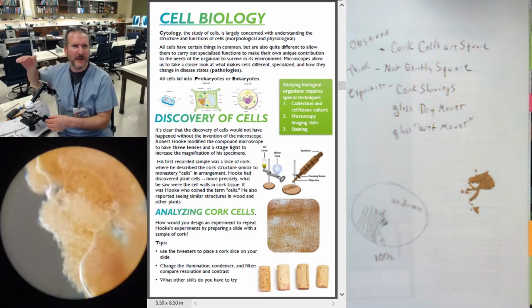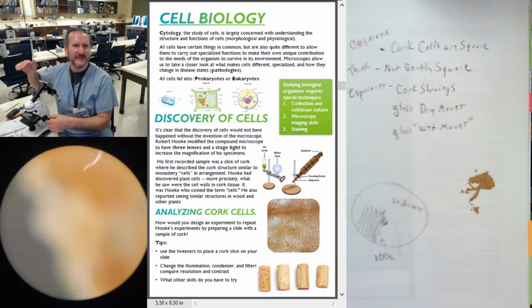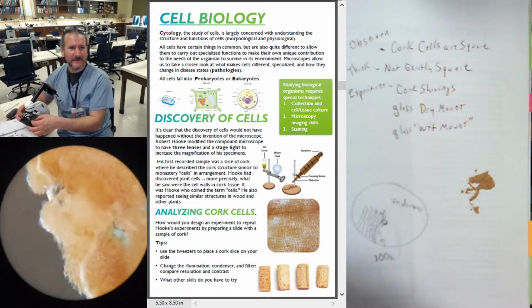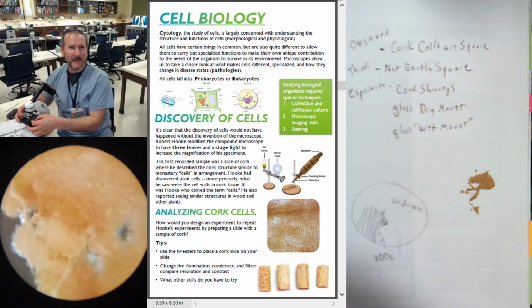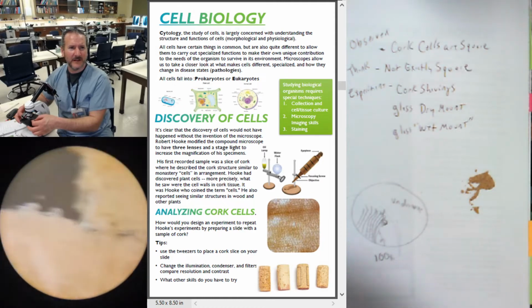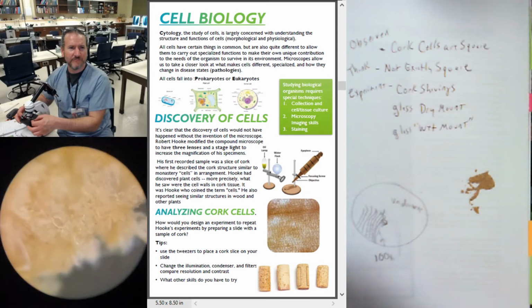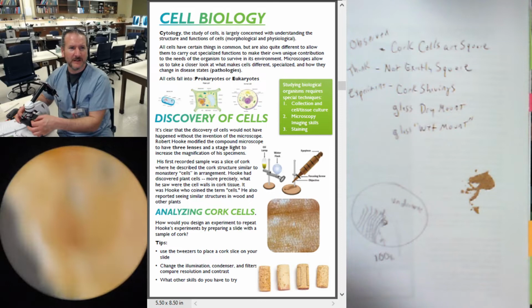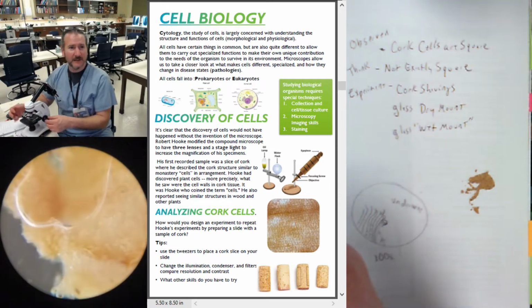Notice we're going through depth. So I can see the top clearly here. Go down a little bit more, I see the bottom more clearly. I think that might be a really good spot. Oops. Let's go back. We're right here. Fine tune it.